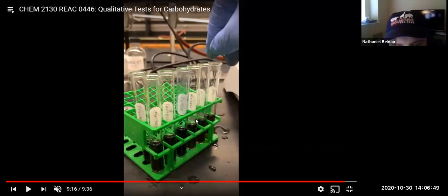So it looks like, yeah, I mean, they all look like the same color, except for maybe xylose. I know that xylose looked a little bit more blue. And then you got maltose there. Looks like just kind of a dirty brown color. Lactose also. So just put whatever color you guys think it is, because to me they all look the same except for xylose, which looks like a little bit of a dark blue color.